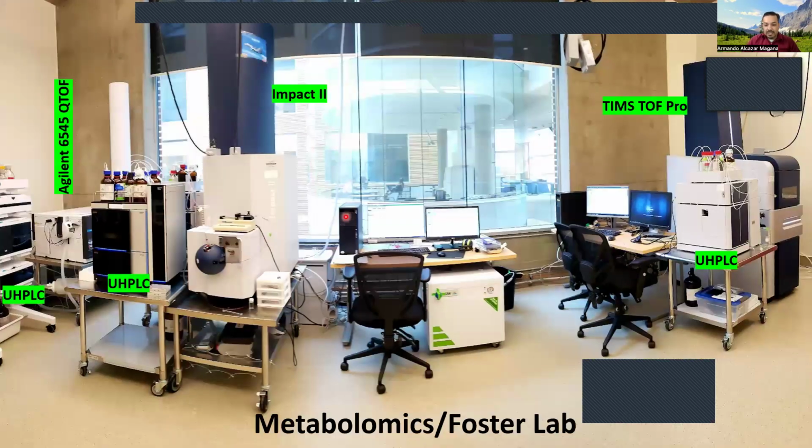This is basically a new lab that has some instruments from Dr. Leonard Foster. The lab is brand new. We started about 2 years ago, and that's the reason I got recruited here at UBC. And we have high resolution mass spectrometers. I will talk a little bit about some applications that we did in the past, not with this instrument, but similar. And actually, some of them were with this timsTOF Pro.